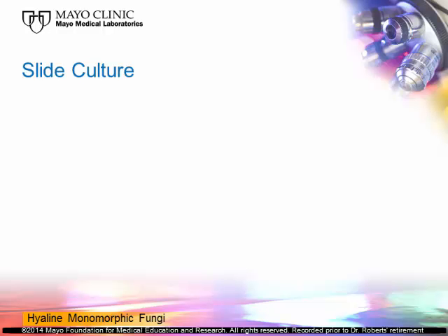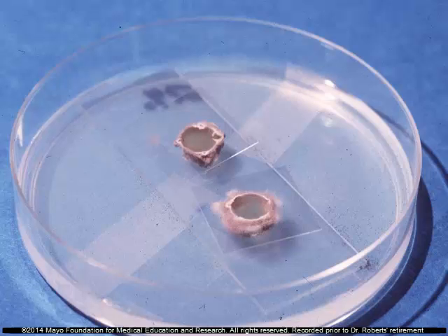And then as a last resort, we have in the past used what's called a slide culture, a micro slide culture. This is an example of what that is. Basically, when you have a problem with a culture and you need to see in detail how it produces the spores, you take a plate of 2% agar, just water agar, and you place a sterile glass rod in there, or you can just lay a slide on top of the agar like you see here.